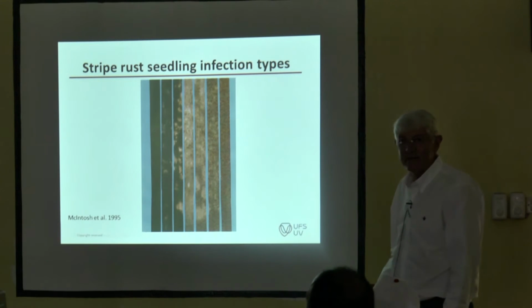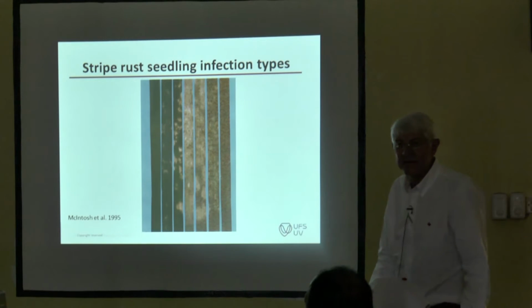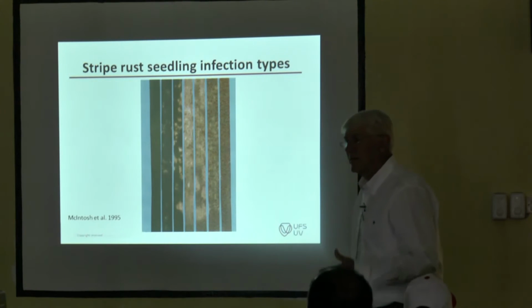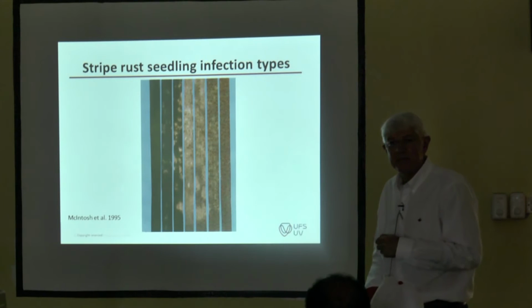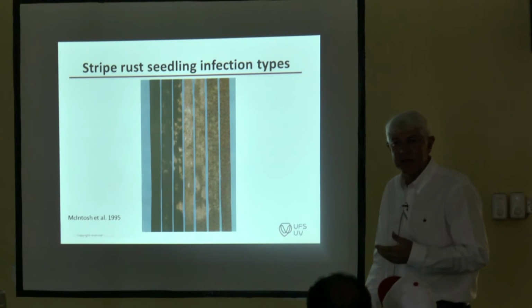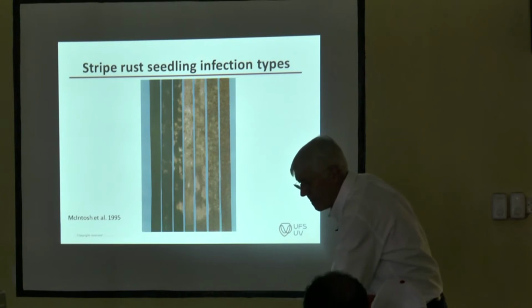And then this, if we look at Evosed 17, we have clear infection, so we term it as virulent. And this is the case of warrior race. So it goes on VPM is 6, 7, but on Evosed it goes compatible. All right, good. So you can see there is some subjectivity in it, but I think as long as you have what they call controlled subjectivity and you're consistent in what you're rating, and you have your checks and you can explain what you're recording.